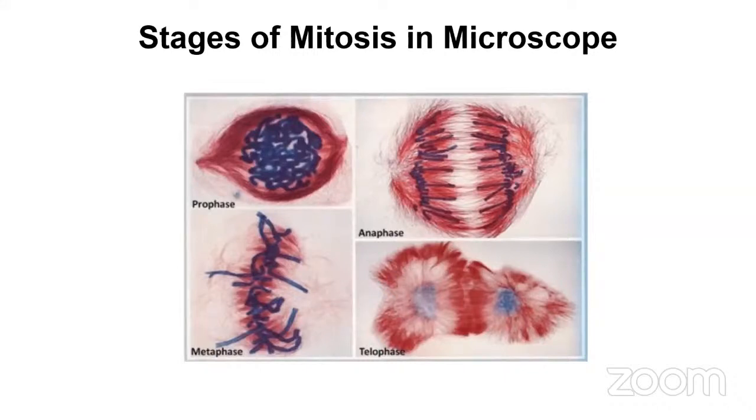You were doing this because this helps new roots to form, and it is very easy to detect mitosis when the root tips are young. That means they are recently grown. Okay, so that's what you are using.